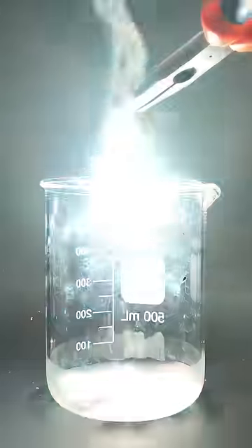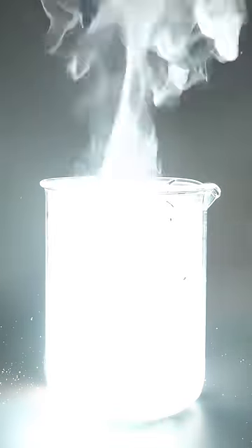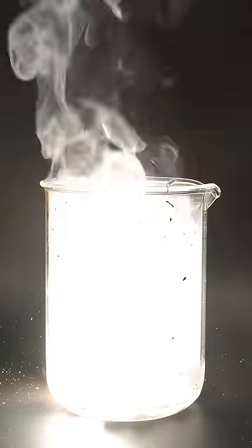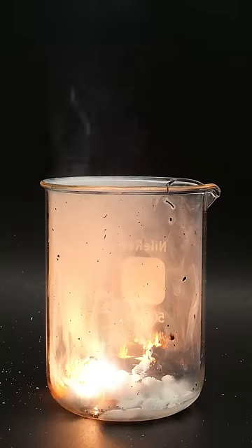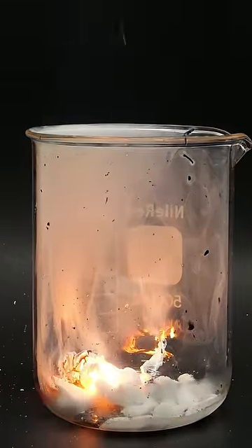In fact, it's apparently burning even better, and it doesn't seem to care that there isn't any oxygen. This is because it's so reactive that it can directly react with the CO2 and rip the oxygen off of it. It's even able to do this with things like water and sand, and I think that's kind of terrifying.